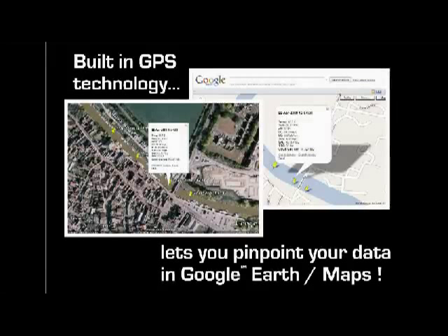All of our Aquameters come with built-in GPS technology as standard. This neat feature allows you to know exactly where each of your measurements were taken. Using the supplied AquaLink software, you can export your measurements into Google Earth.